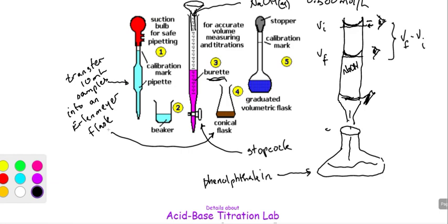And phenolphthalein is an indicator, and it changes color once the pH is in this range, 8.2, I believe. And again, you can take a look at page 10 of your data booklet. It tells us that phenolphthalein, and we'll talk more about this in lecture this week, changes color in this pH range, about 8.2 to 10. Below 8.2, it's a colorless liquid, but above a pH of 10, it becomes a really bright pink. In fact, you might even say it's a fuchsia.